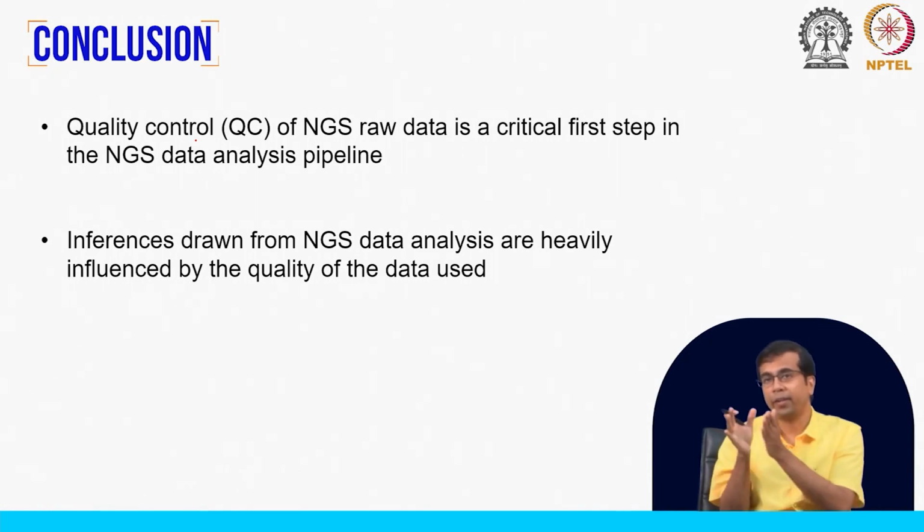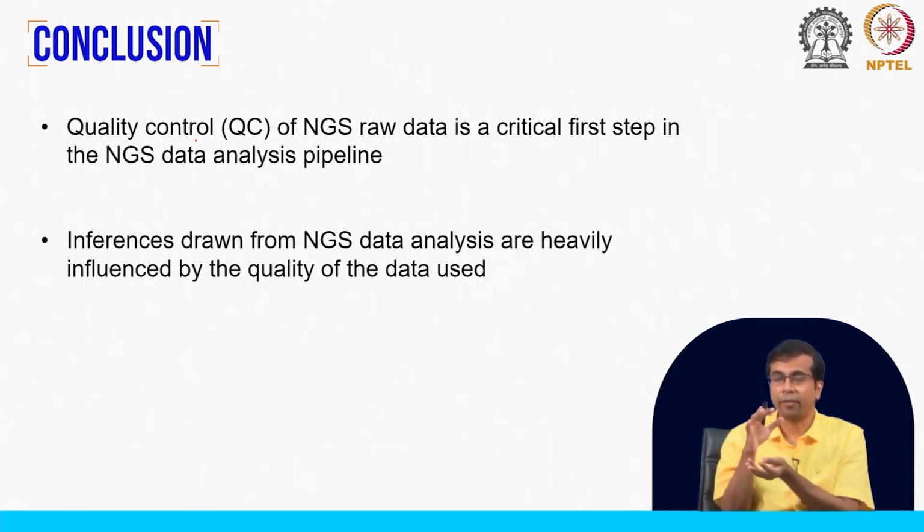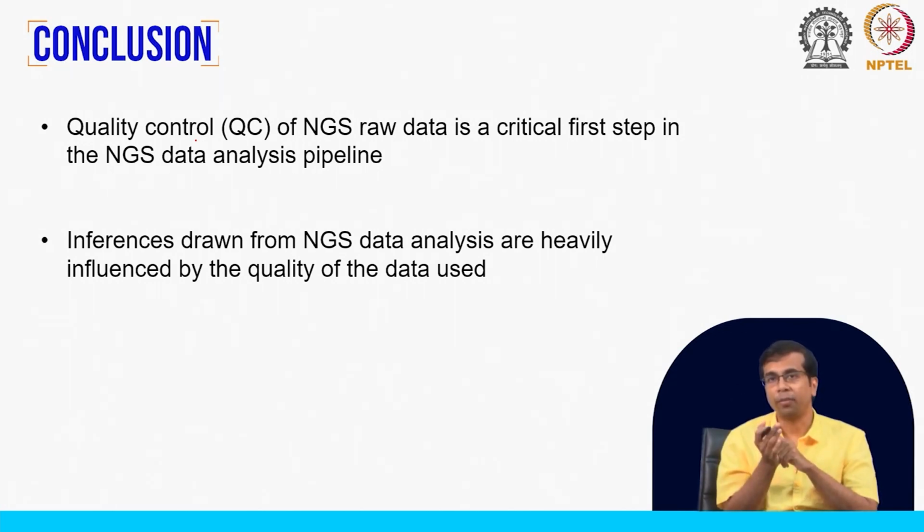Towards the end of the read, when you are detecting these clusters of sequences, you are sequencing in clusters, you are getting the average signal. Some of the molecules might go out of sync, and this is a problem which we call phasing or pre-phasing, and this gives you a low signal to noise ratio, which affects the quality score. So, we have talked about this per base quality score.